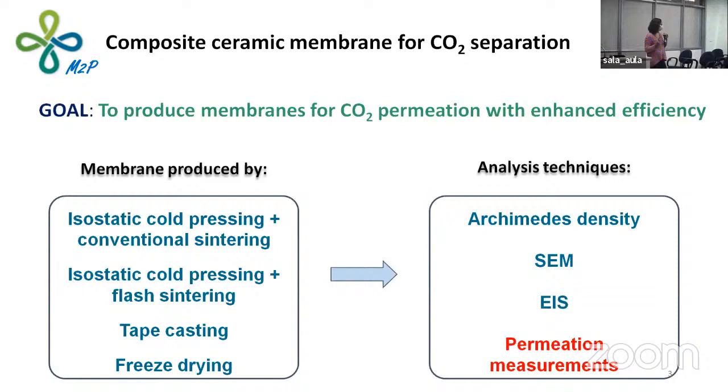After obtaining those porous membranes, we perform the infiltration with molten carbonate. And those are some of the analysis techniques that we perform on those samples. We have Archimedes density to analyze the porosity of the samples, the porous matrix. We perform scanning electron microscope images to analyze the pore structure and to analyze the percolation of this molten carbonate.